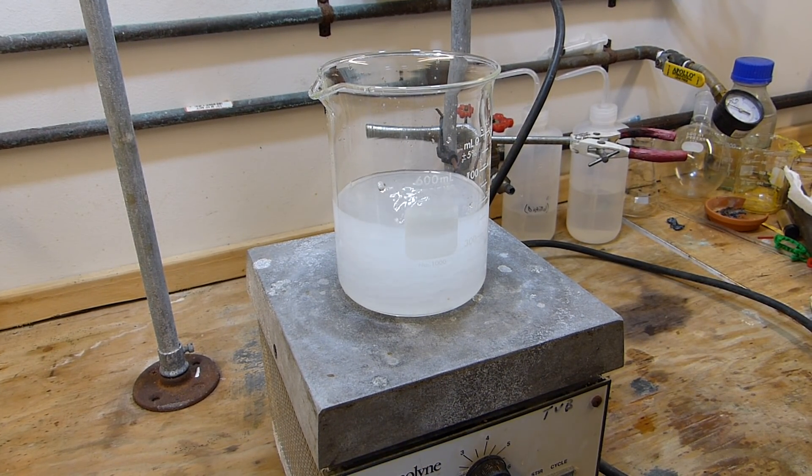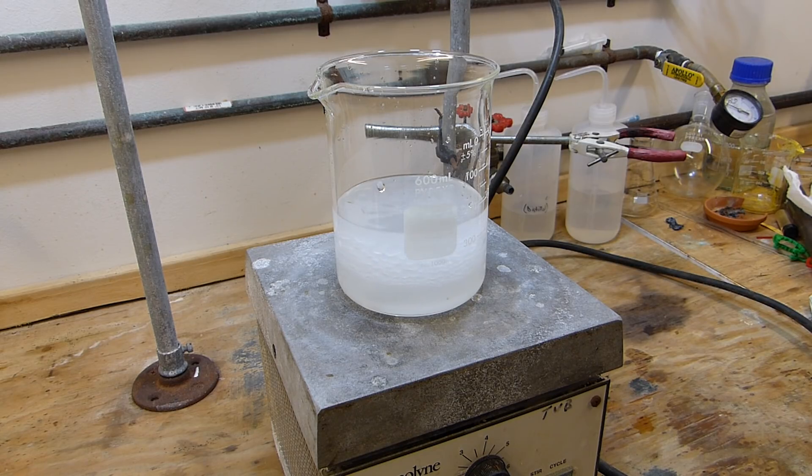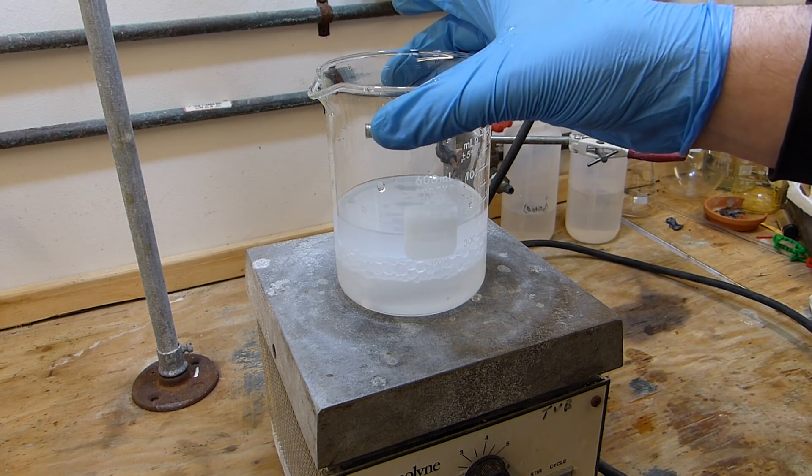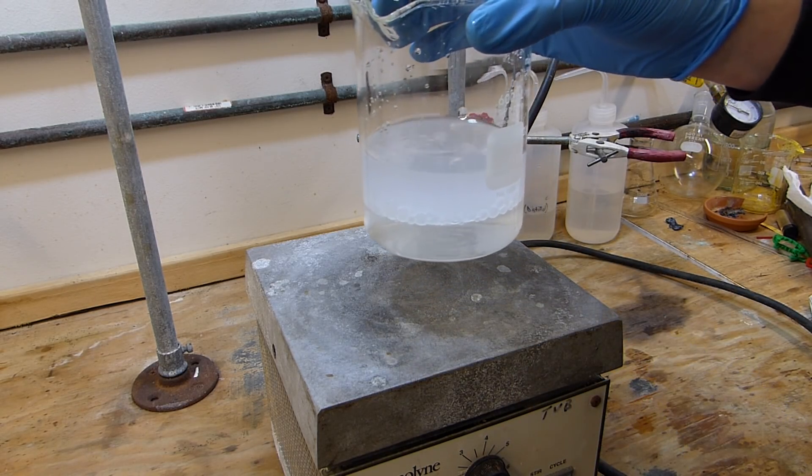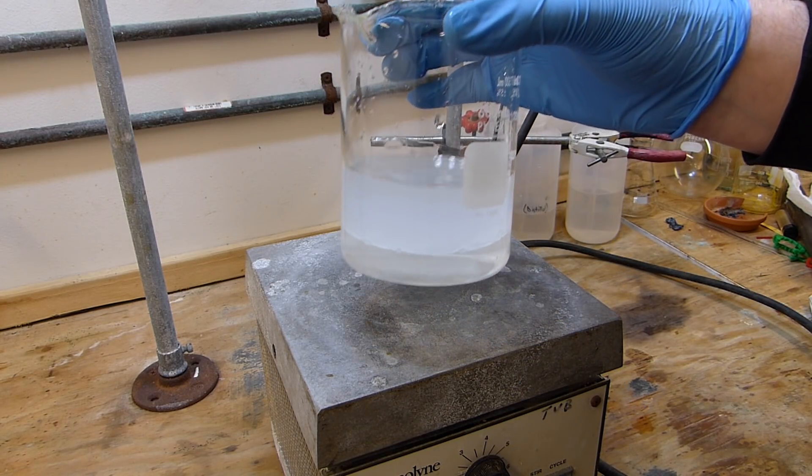This has been stirring for about five minutes. I'm going to turn the stirring off and let everything settle out. While that's occurring I'm going to set it aside and then set up the apparatus for the Dean-Stark trap and everything that we'll need to make the sulfonic acid.